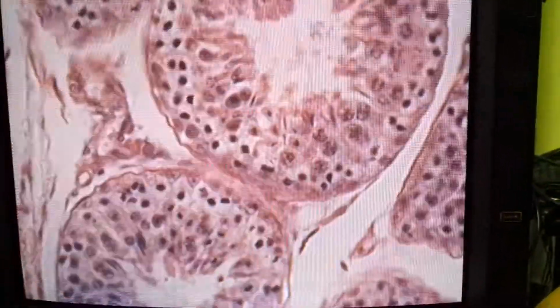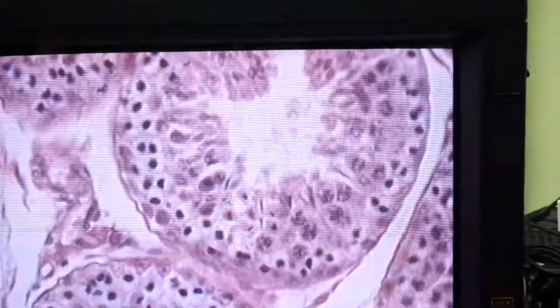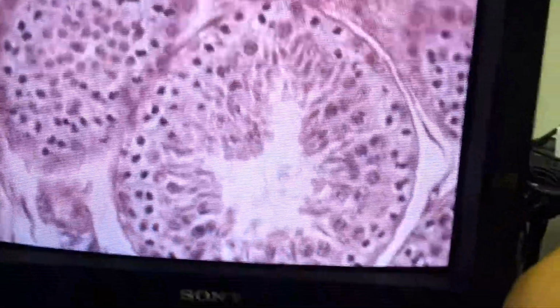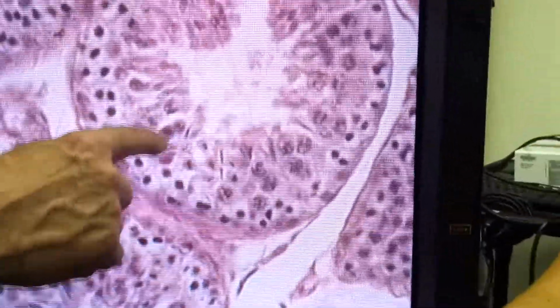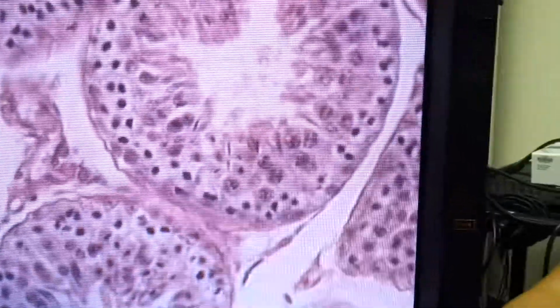This is interesting. I'm focusing on this because I've never quite seen one like that before. It's an interesting cell. It's a super sperm. Super sperm, I don't know what it is. It's primary? I don't know. It looks like a primary, but maybe it's at a particular stage of mitosis, so it's not obvious.